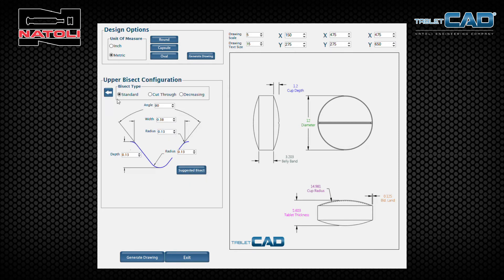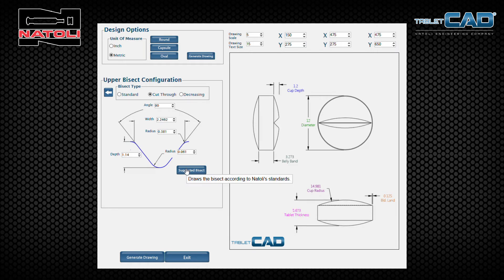This replaces the control panel with a new control panel for bisect configuration. We have three standard types of bisects: standard, cut-through bisect, and the decreasing style bisect. Simply click on the suggested bisect button that we've incorporated into this panel and you notice the bisect becomes appropriately sized for this tablet.